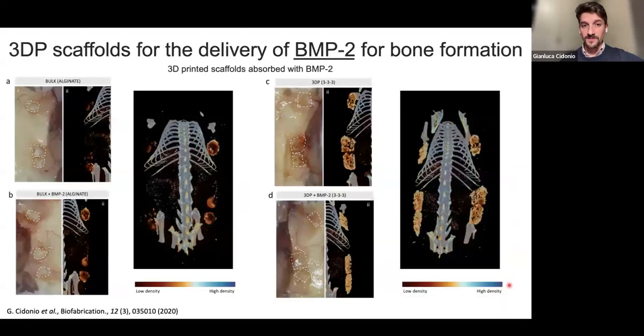and looking at the possibility to harness the power of vascularization to drive bone formation. And if you look at the further study that we did, it was really looking into the possibility to change the material and to change the function. So be aware that this work here specifically is without cells. And it's pretty interesting because even without cells, you have a little bit of mineralization on the control.